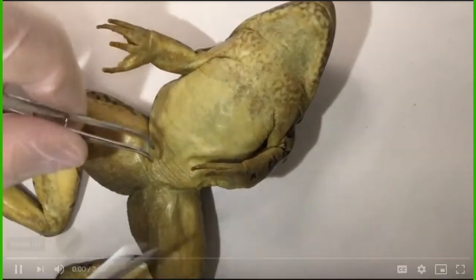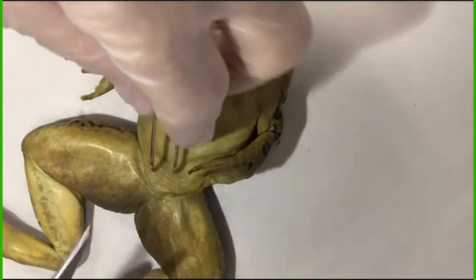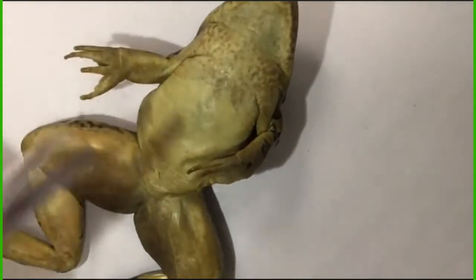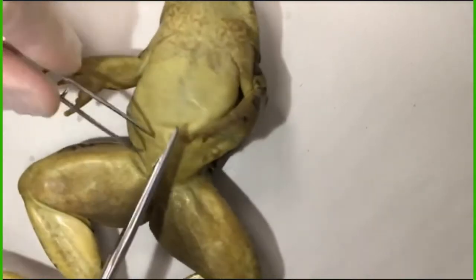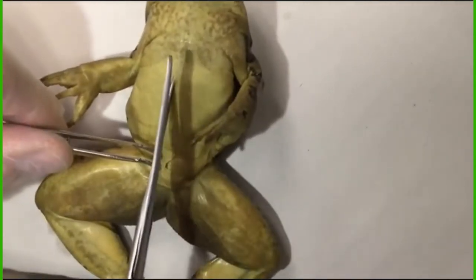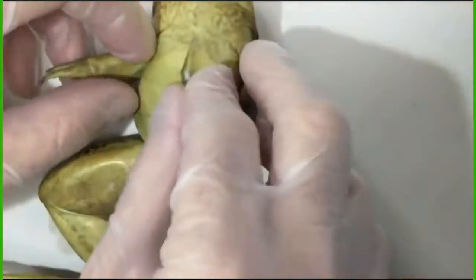Okay, so taking you through the dissection of this frog. And first step is to get underneath the skin. The skin is really paper thin, and you just need to make a little incision right there at the base of the legs, the bottom of the abdomen, and snip all the way up to the chin. And just get right underneath, between the skin and the muscle tissue. It's really easy to cut because it is extremely thin.